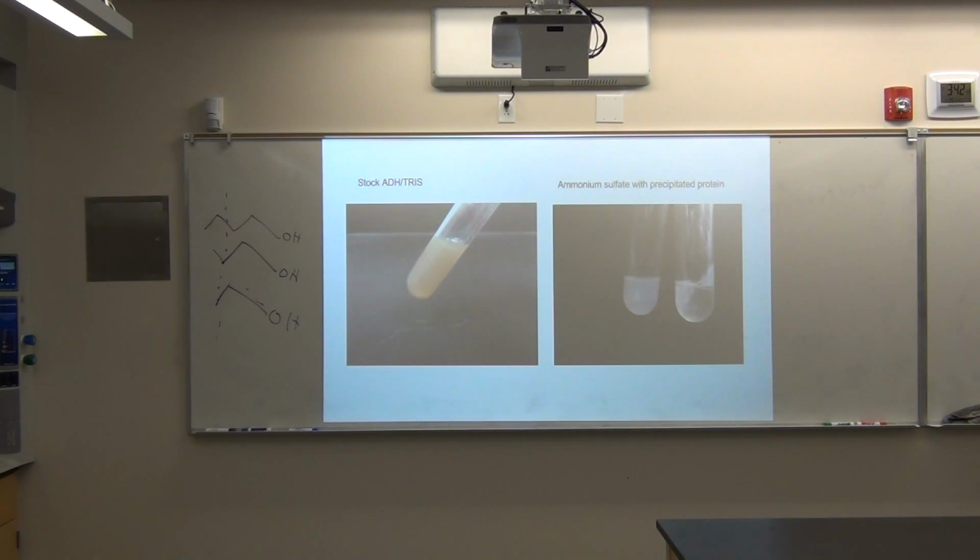The regular tris stock solution was more white, and the other one was darker, and then the pellets and the proteins would be a different color. And so we tried making the pellet and then using saturated tris to preserve it, and that worked really well. And another really surprising result they had was in the salting out: they found more active and more purified enzyme if they salted out, all other conditions identical, from a diluted stock than from the actual stock that they pulled from the baker's yeast.